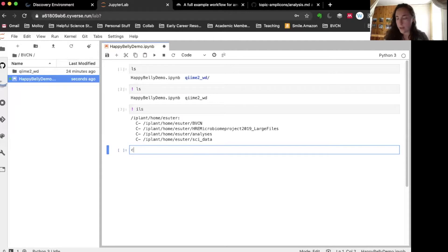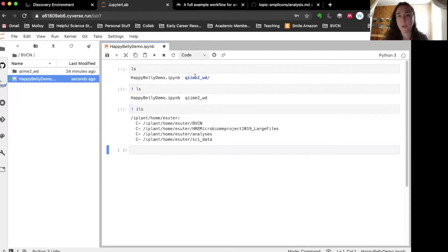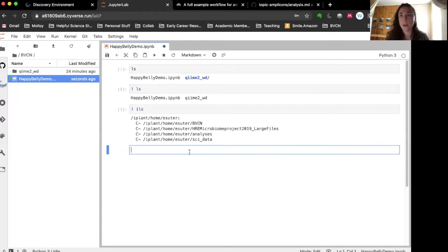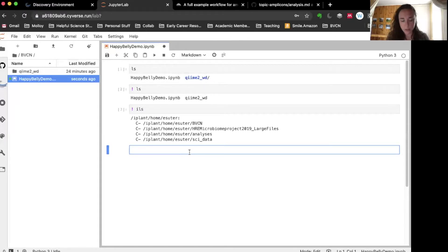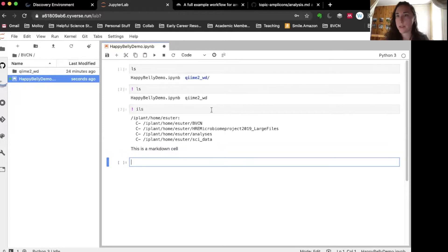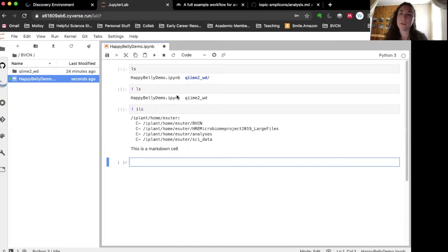Another neat thing about Jupyter notebooks is that you can make markdown cells, so a notebook can be code integrated with annotations. When I'm using a markdown cell, I want to say 'this is a markdown cell' and now it just appears as plain text. After this video I'm going to post my fully annotated QIIME 2 pipeline in the notebook in this format, so you can see all the details of what we're working on.